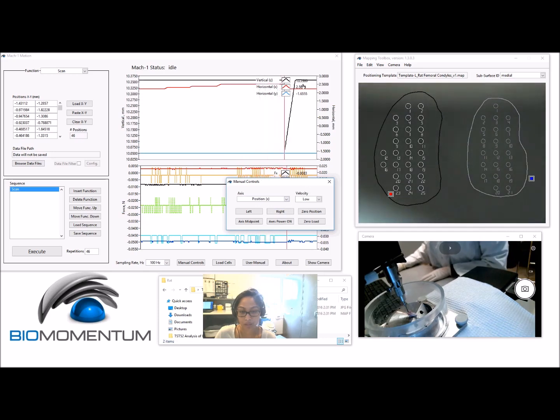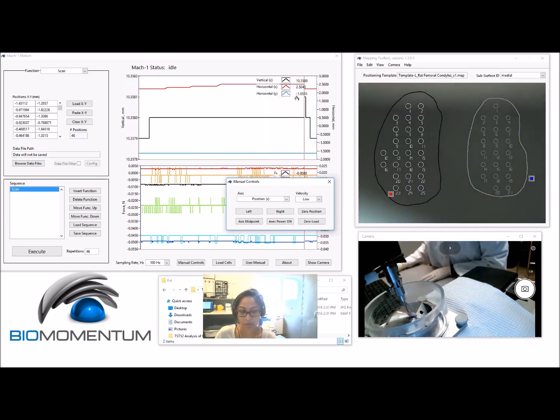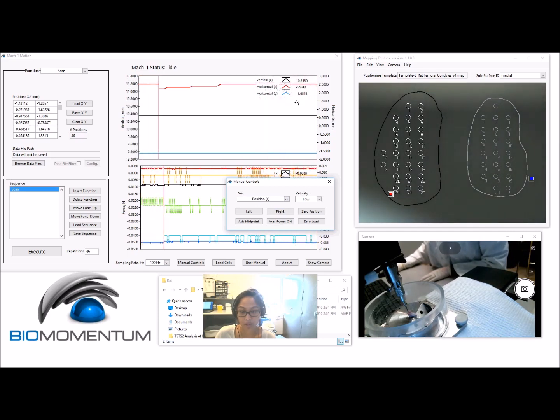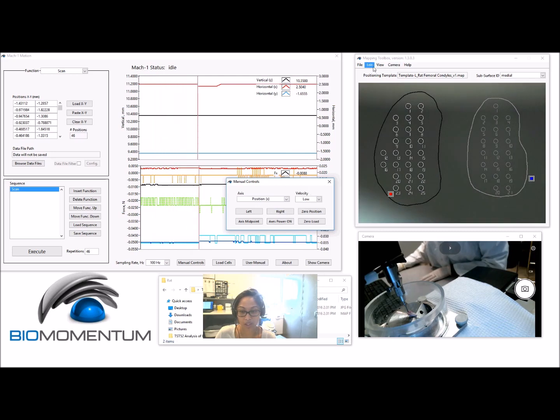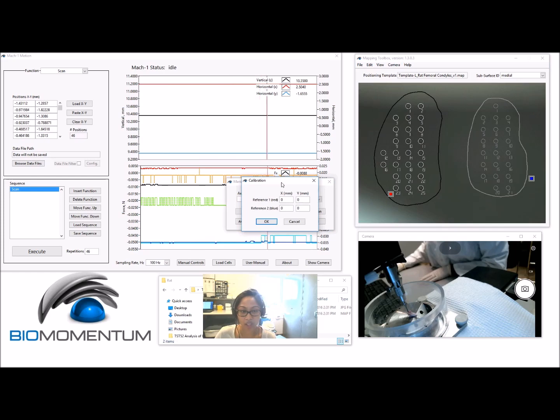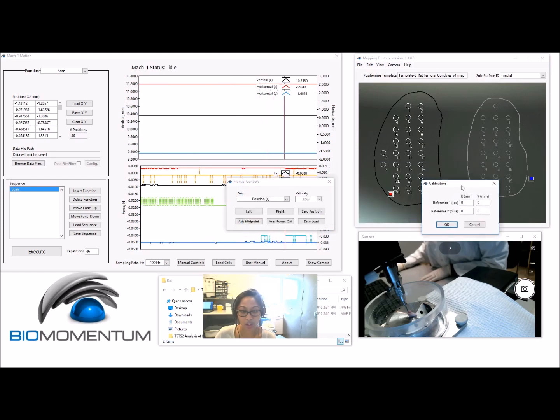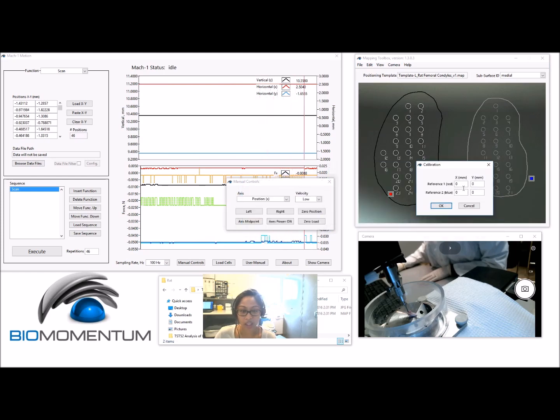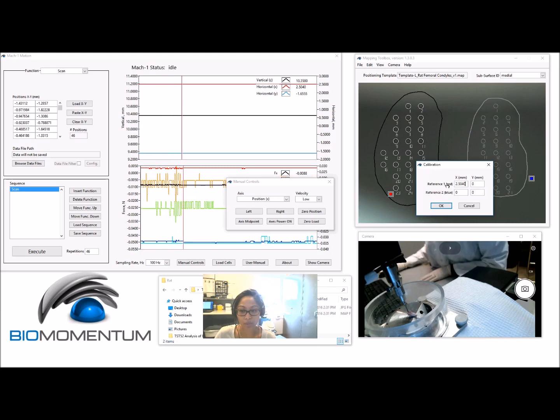The coordinate system used in this method corresponds to the MAC1 horizontal stages. Report the X and Y stage position in the calibration pop-up window of the mapping toolbox software.